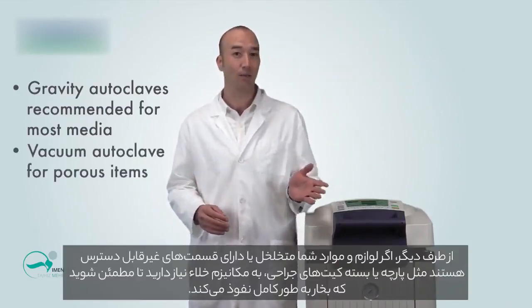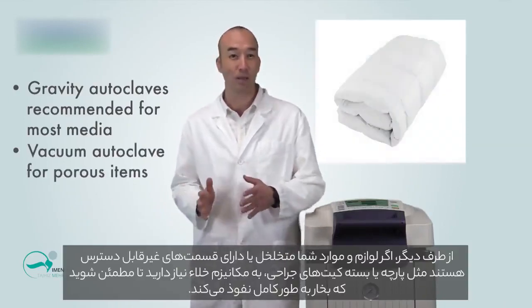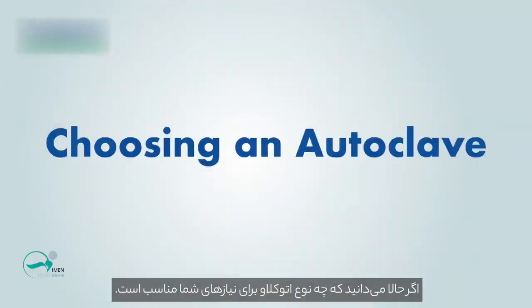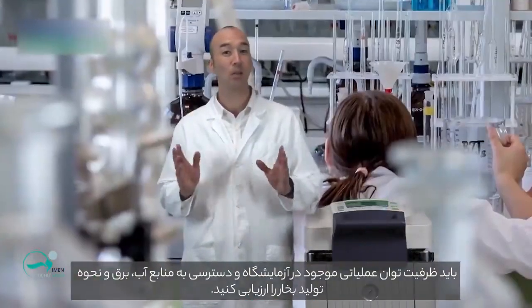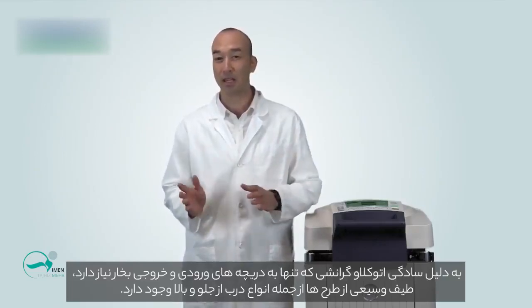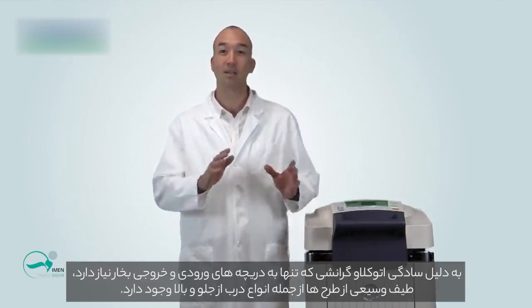On the other hand, if you're autoclaving items that are porous or contain hard-to-reach areas, such as fabrics or wrapped surgical kits, you'll need a vacuum mechanism to make sure that the steam penetrates your media completely. Though you may now know what type of autoclave is suitable for your needs, you'll also need to assess your throughput capacity, available lab space, and access to electricity, water, and house steam. Due to the simplicity of the gravity autoclave, which requires a heater, intake, and exhaust valves, there's a great range of designs including front and top loading types.